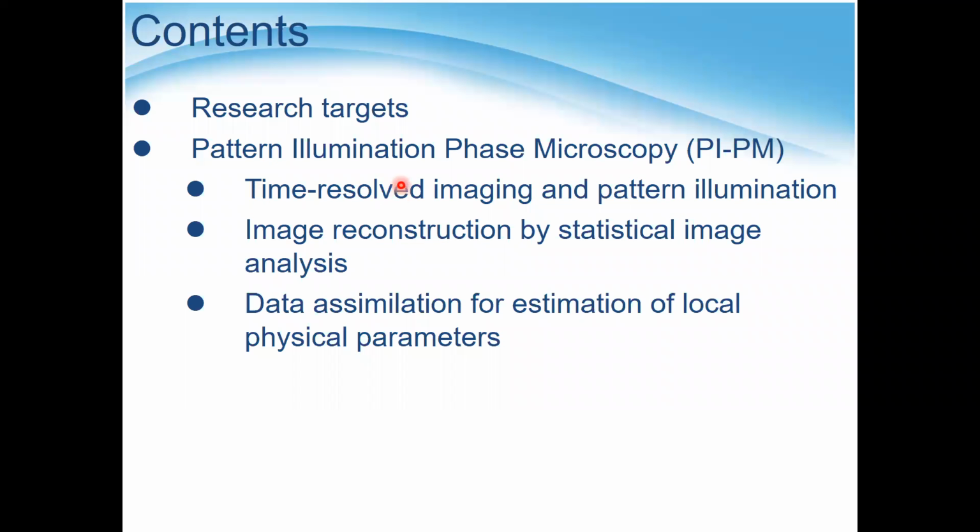Okay, then we've developed a new microscopy to study the charge carriers called pattern illumination, kind of time-resolved phase microscopy. I call this one PIPM method. And first, hardware things, meaning what's the concept of this microscope and how to improve the time resolution, and why do we need the pattern illumination. Okay, so first I'm going to talk about this one.